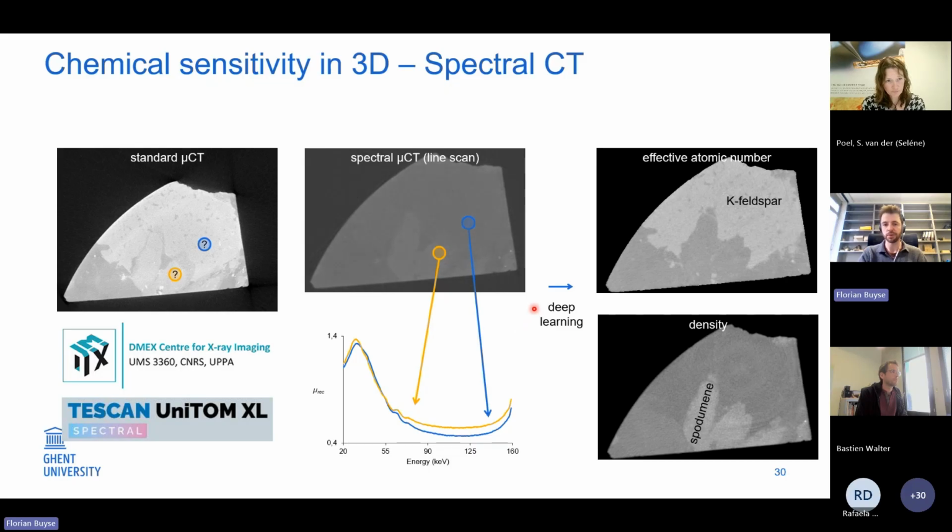But by using deep learning, or this can be done by yourself as well, I guess, there is a possibility to directly see those minerals here. Of course, I have not recreated this section into a thin section. I just knew that these minerals are present in general in that rock, not specifically on this slice.